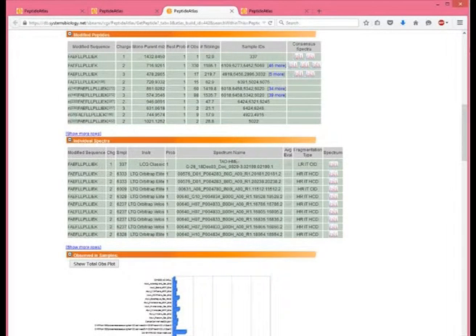Down below that, we have consensus spectra. So we basically report all the peptide ions. These 3 have the same sequence in that they're not modified, but they have 3 different charges. Then going down here, we have different mass modifications, combined with different charge. So again, the combination of linear sequence plus mass modifications plus charge represents a peptide ion. For these ones that are unmodified, we actually have consensus spectra, and you click on one of these and you'll see a spectrum. But we also have all the spectra that were observed, and this is a plot that shows the observation frequency for each one of these.